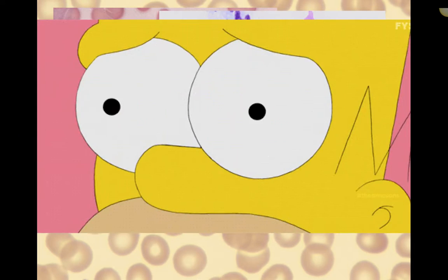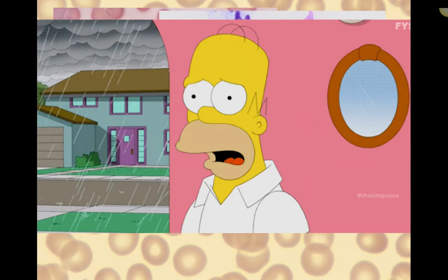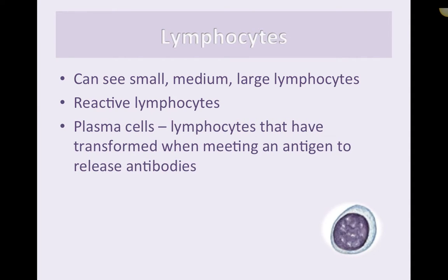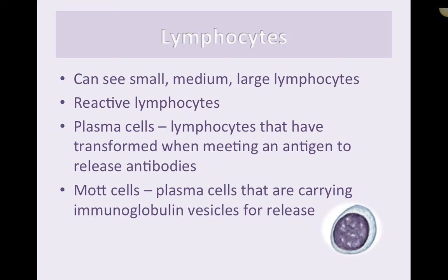Don't get overwhelmed — just take your time, look at lots of slides, and you'll get used to degenerative neutrophils. Lymphocytes can be seen small, medium, and large. We have reactive lymphocytes in inflammation, and we also have plasma cells — lymphocytes that have transformed when meeting an antigen to release antibodies. Plasma cells relate to immune response, and mott cells likewise represent immune response.